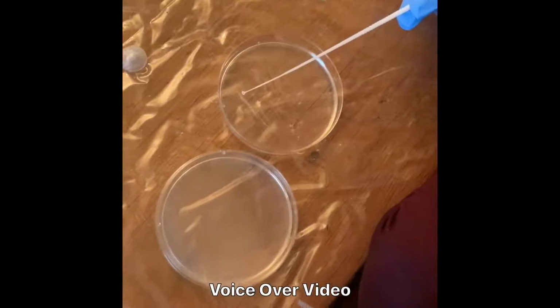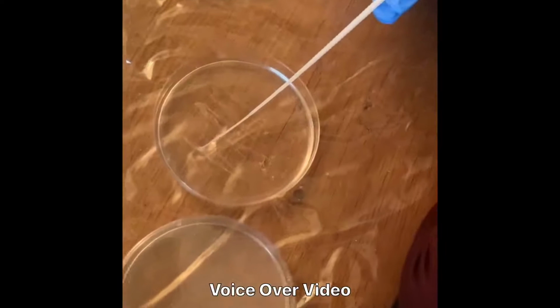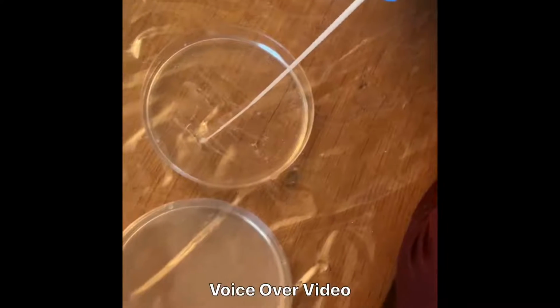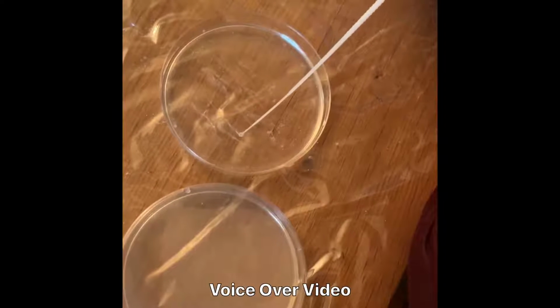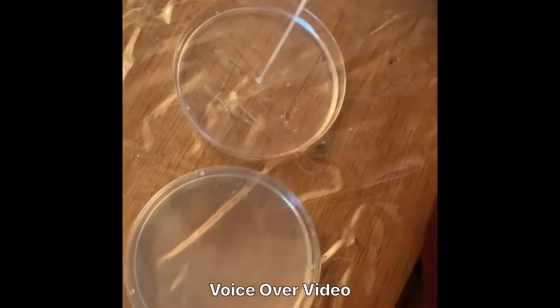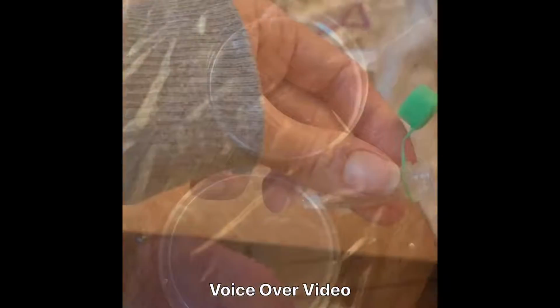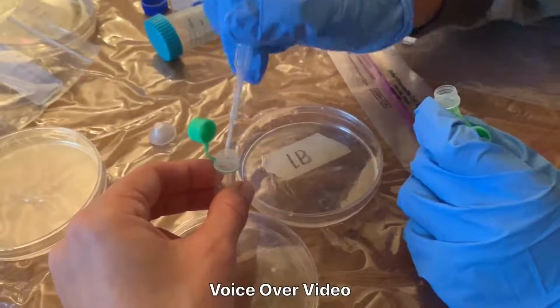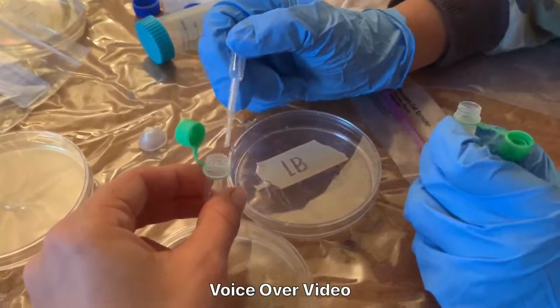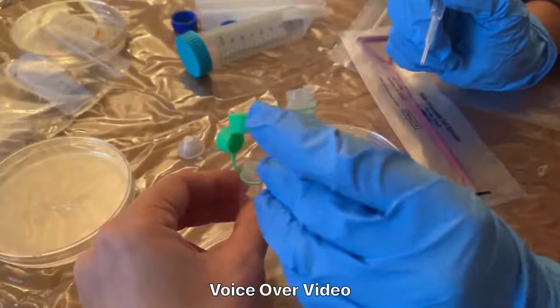The next thing, after I let those set and the bacteria grew in the LB agar, it grew some bacteria, so I took that off the new loop, and then I took that and the loop is filled. I grabbed it and then put it into this liquid.